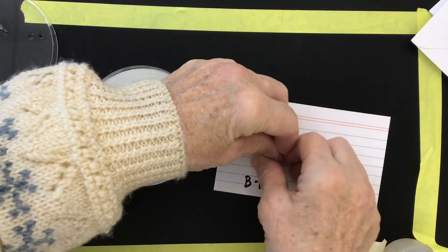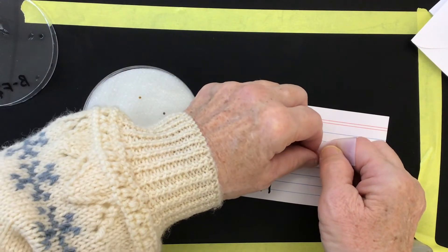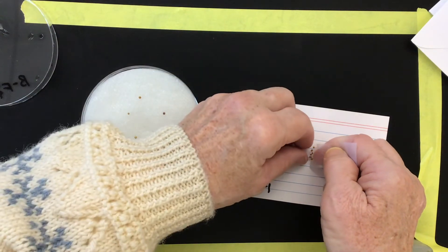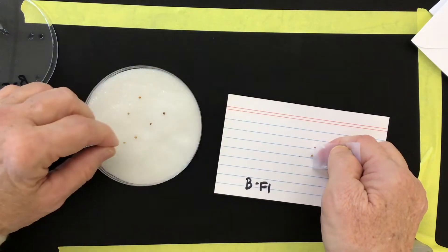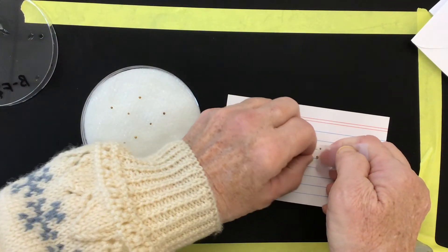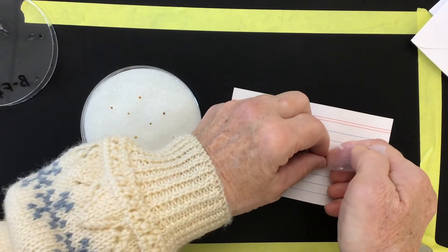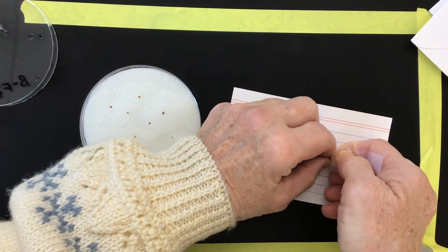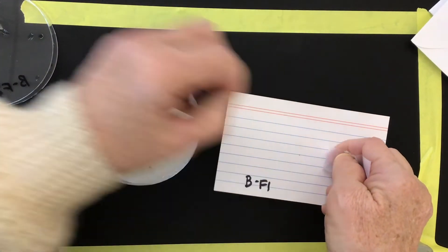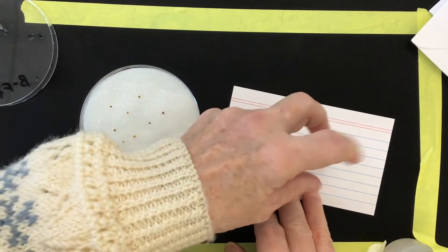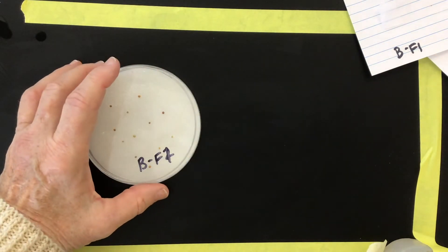We're going to take our seeds from the tape slowly. You don't want to take too many off at a time in case they drop. Take your seeds, spread them out on your dish. When you get to the F2s, there are a few more. There's around 11 or so seeds for each of the F1s and there are about 14 or so on the F2s. And then we put our cover on. And now you repeat that with the next two.